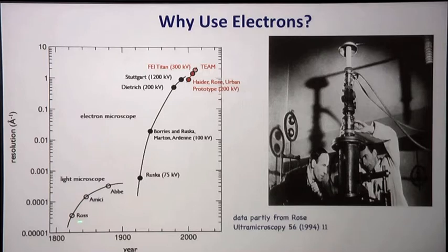So the progress in optical microscopes started here in the 1800s and quite rapidly progressed as lens design and the ability to grind more and more accurate and better lenses. But eventually it petered out because of the diffraction limit of light. And now super resolution techniques and really fancy and clever people can push this up to maybe about here. This is say 10 nanometers.